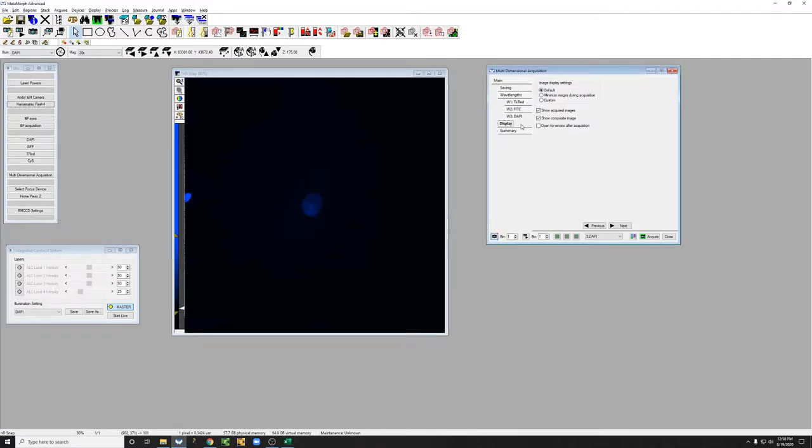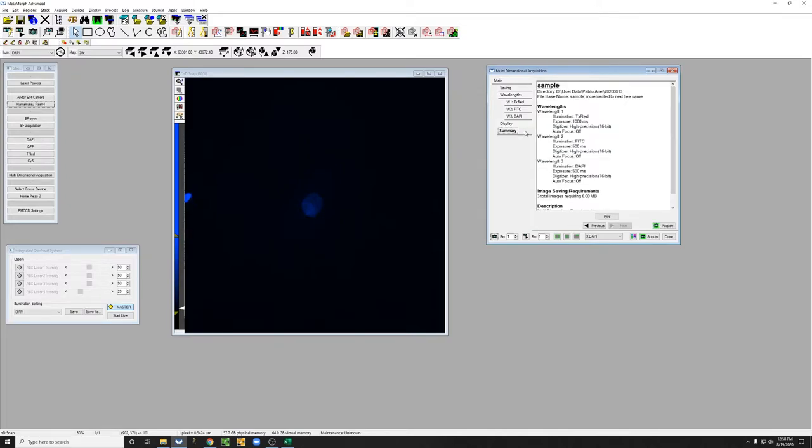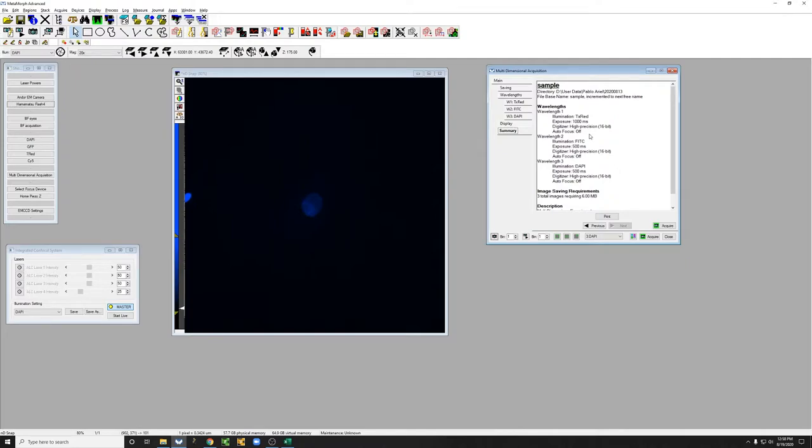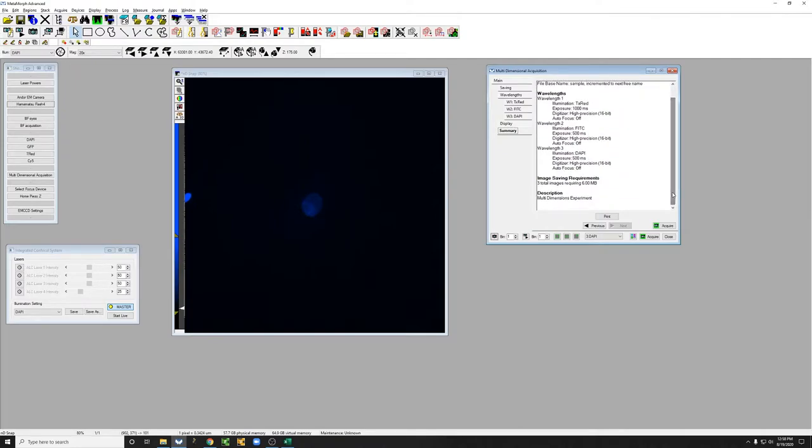If we go to display, this has information on how the data is going to be displayed during the experiment, and it's always worth checking summary to make sure that we confirm that things are being saved where we want, with the name that we want, with the wavelengths that we want, before hitting this acquire button, which will actually take the images.